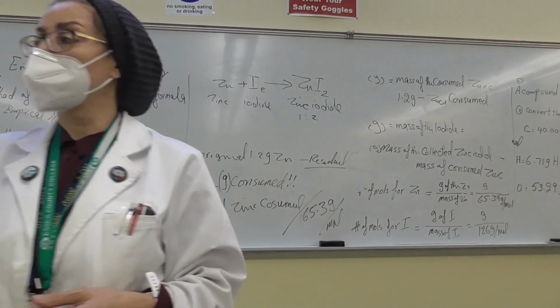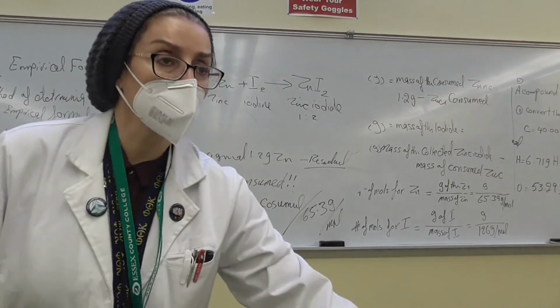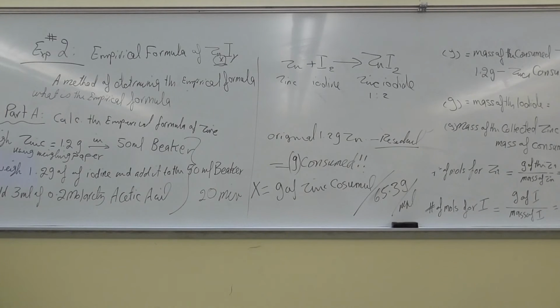So everybody got the dish? You have everything. You can start. Make sure you wear your goggles, please, when you weigh over here, because you need to be careful with the water. And anything more than 3, don't throw it away in the sink. We have it under the hood. You throw it in those funnels with the Erlenmeyer flask.